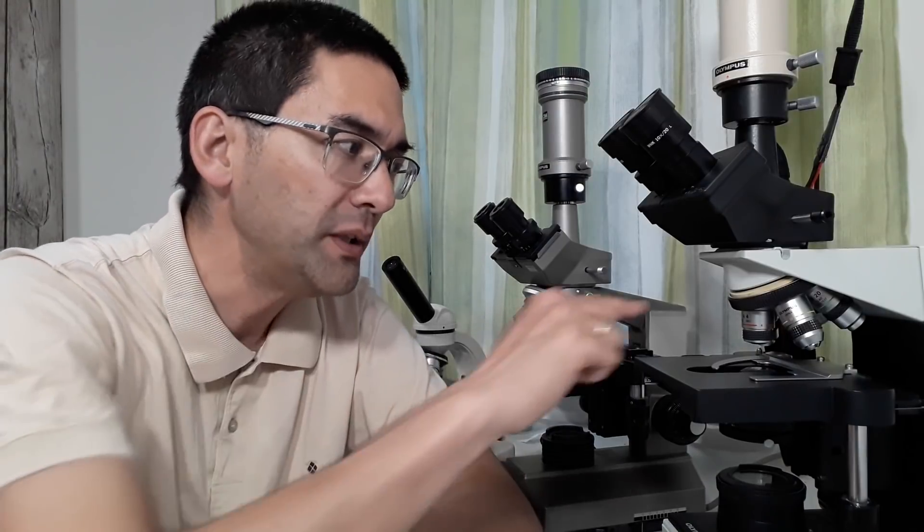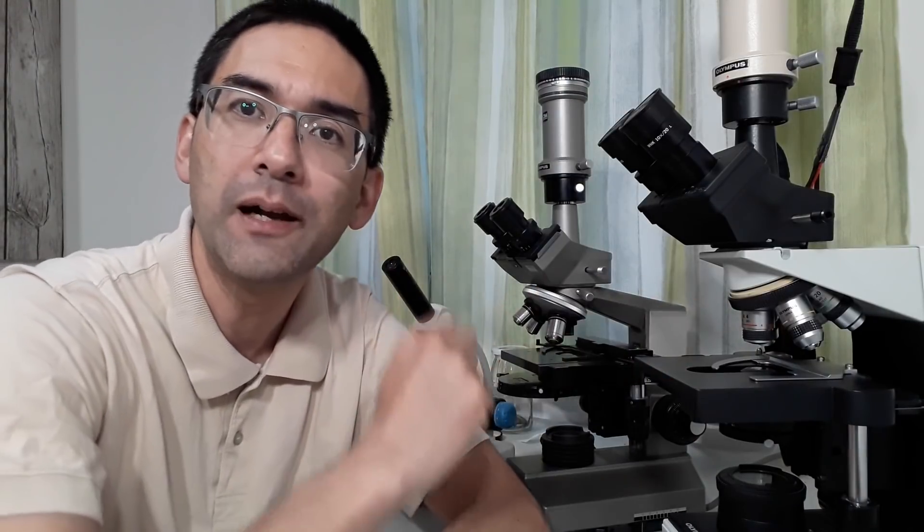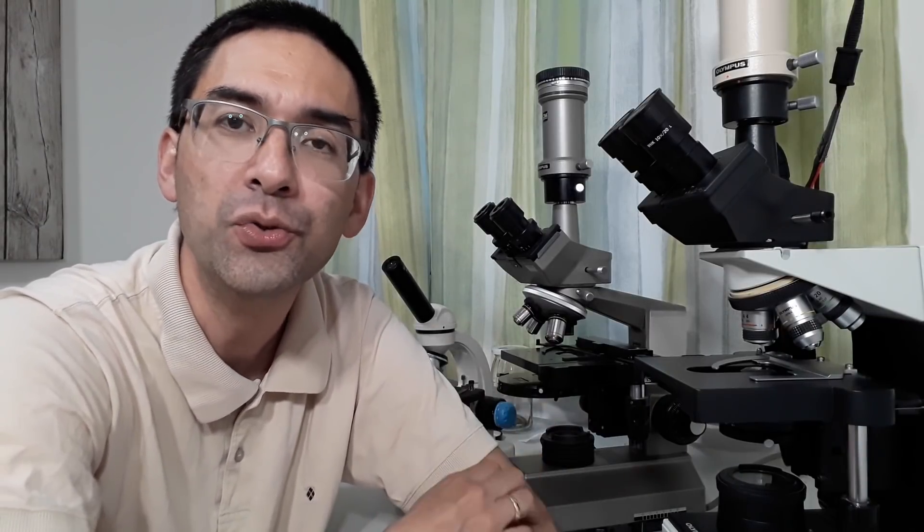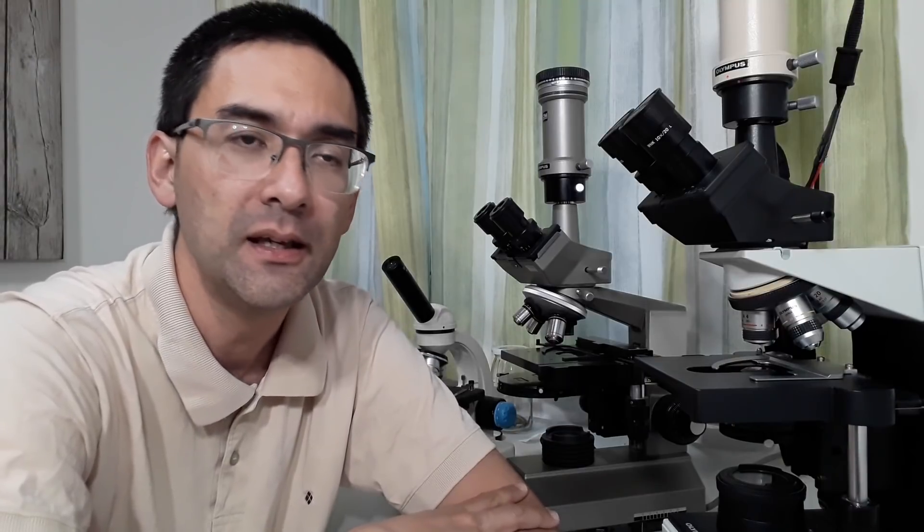Otherwise get yourself a bright field microscope with achromatic objectives, four times, 10 times, 40 times, at least. I personally also have a 20 times objective here because 20 times is very good for observing water samples. If you want to observe yeast cells and often in biotechnology, you observe yeast cells because you're into brewing alcoholic fermentation, you use yeast, then basically you can already see these cells with a total magnification of a hundred times, very easily 400 times, of course, as well.